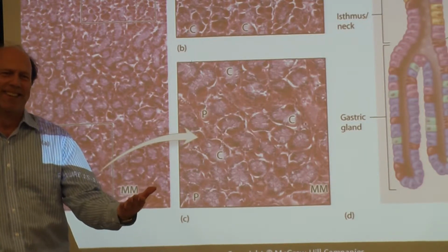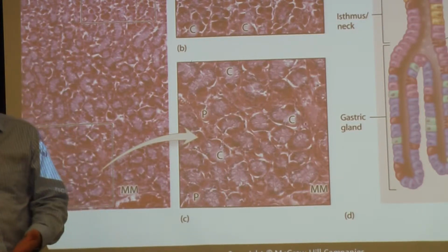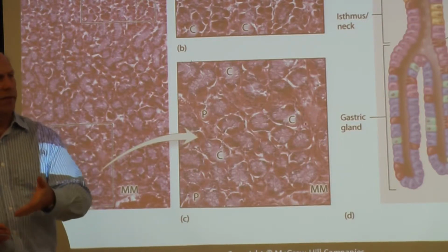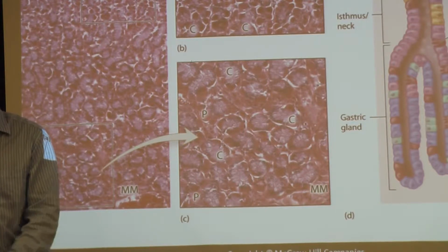Isn't that funny? So it's actually the same cell. If you stained that same cell with a silver compound, then people identifying those cells would call them argentaffin cells. Well, argent is silver, argentaffin cell. So it shows you how our naming for the cells is sometimes derived from the stains that we use.